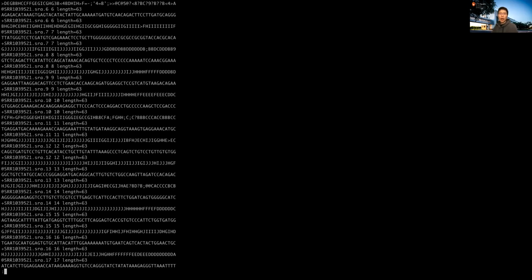Good question. If you want to know which character corresponds to which quality score, you can simply Google the Phred score of sequencing, PHRED. I think there's a lookup table for you. And most quality control software generates the stats, or even pre-filtering and trimming, based on the quality scores.